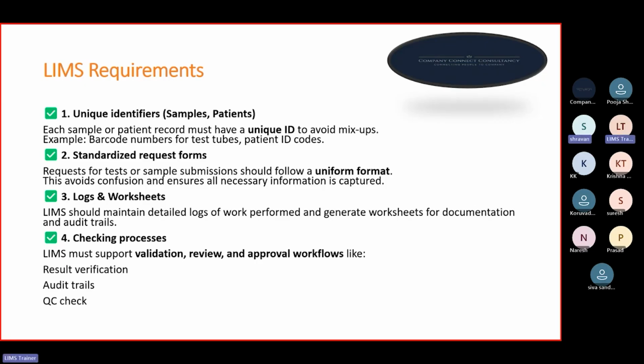No, master data creation is separate. See, there are two different scenarios I explained. The first scenario is that there is no LIMS at all in the laboratory, in a pharmaceutical lab, and now they are going to implement LIMS. So first, as a LIMS consultant, implementation.